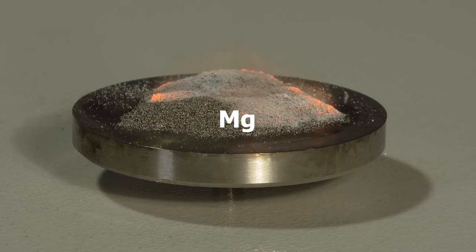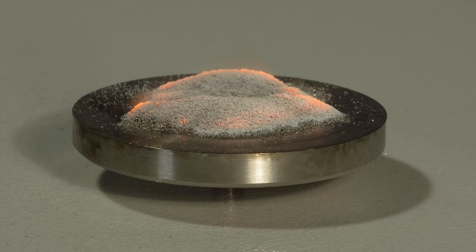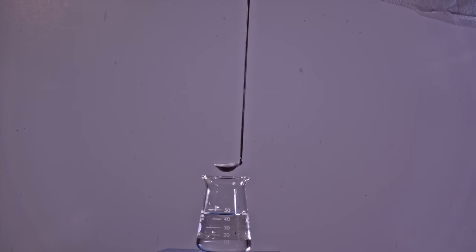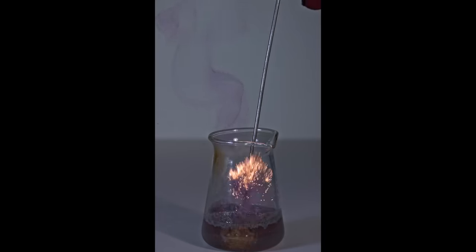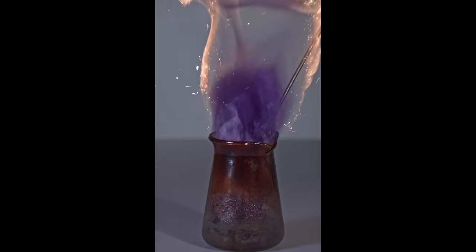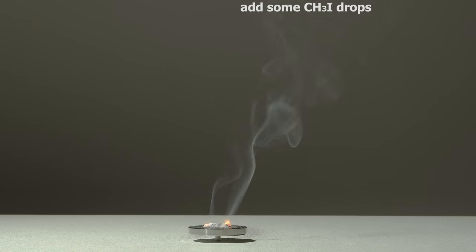Burning magnesium actively decomposes chloroalkanes. I already dropped burning magnesium in methylene chloride, chloroform and carbon tetrachloride. Now it's time to try out the same thing with iodine-containing hydrocarbons. Methyl iodide is the first one to go.